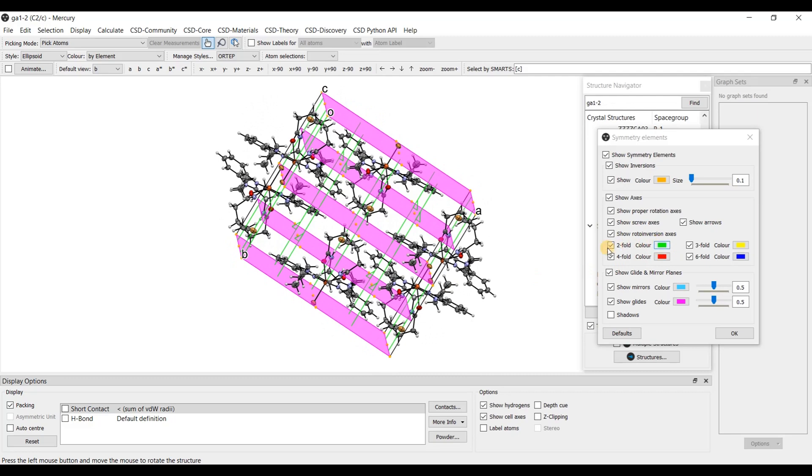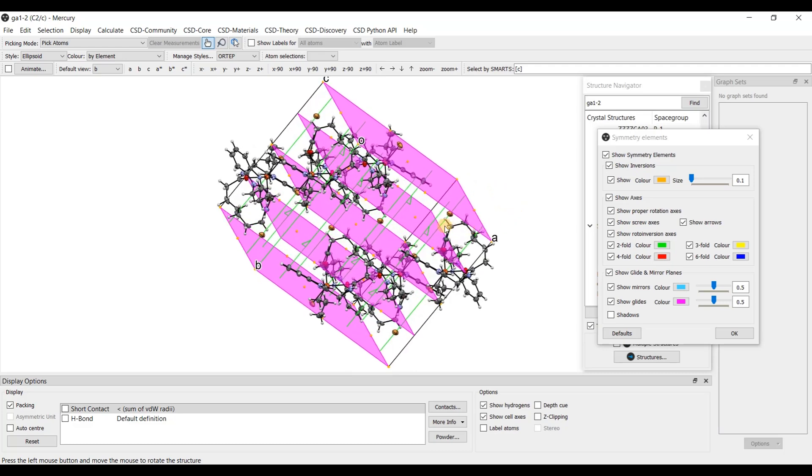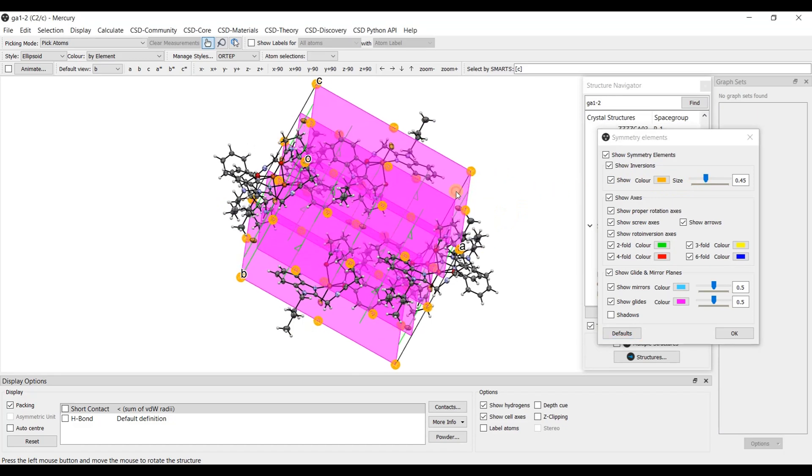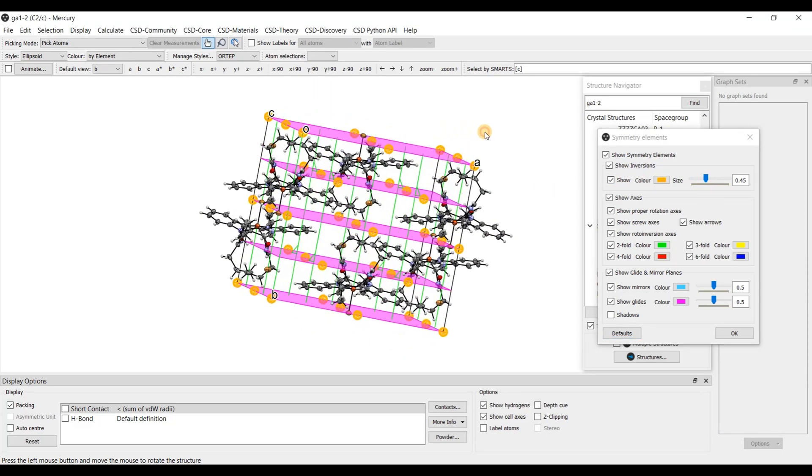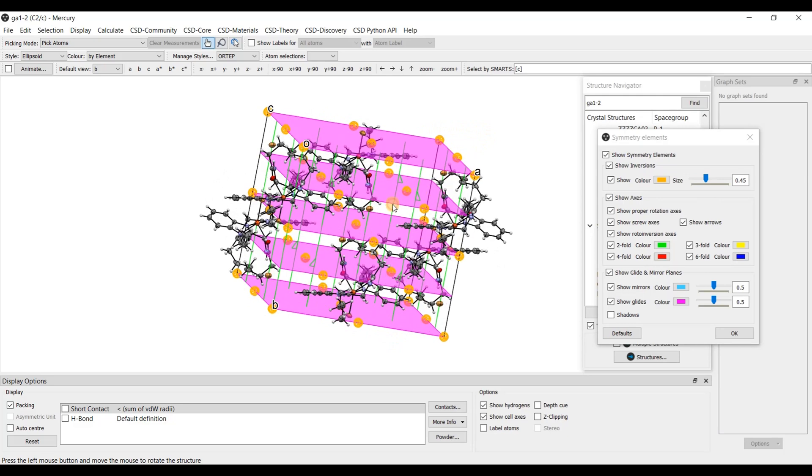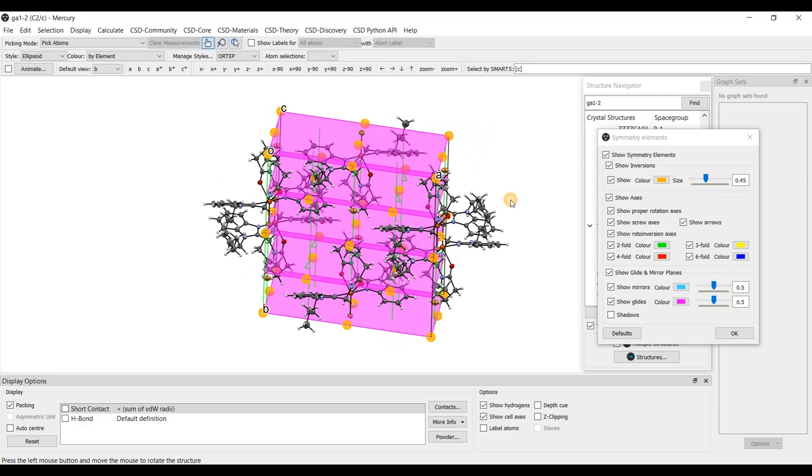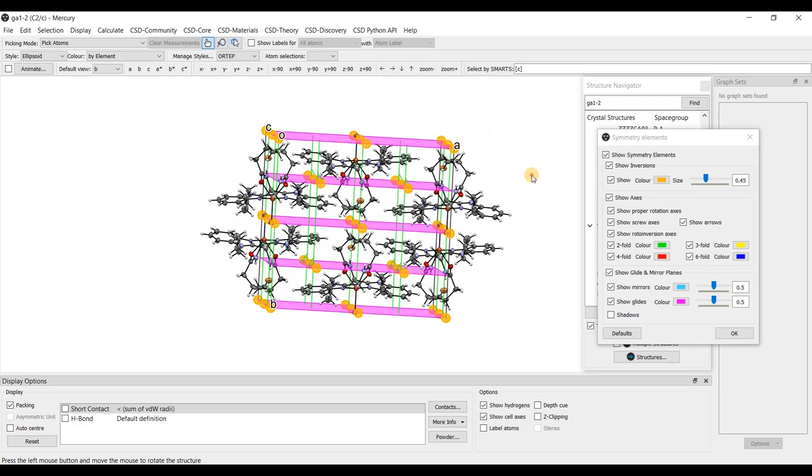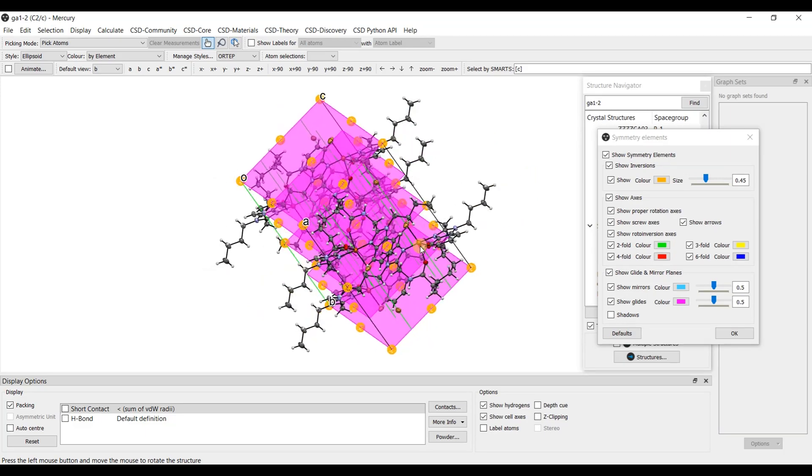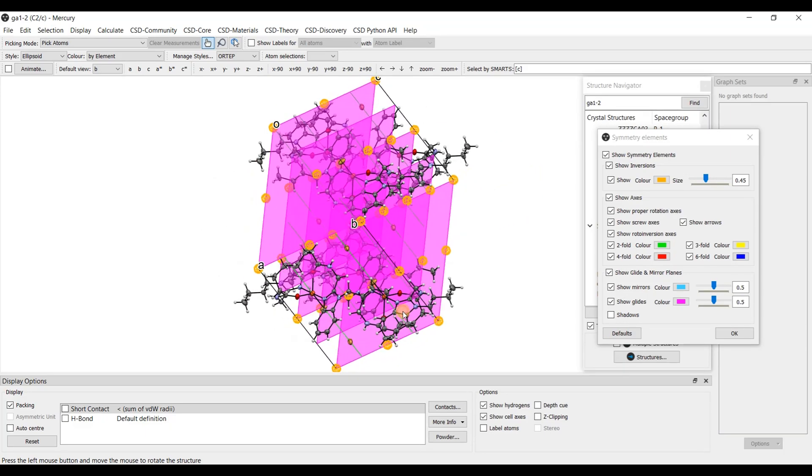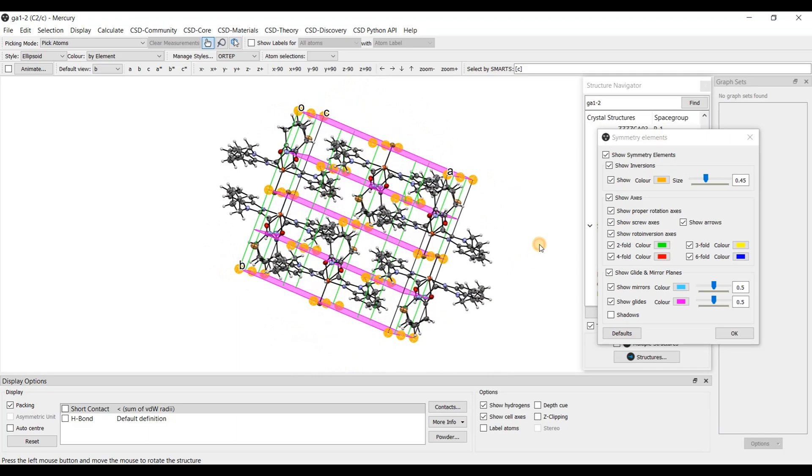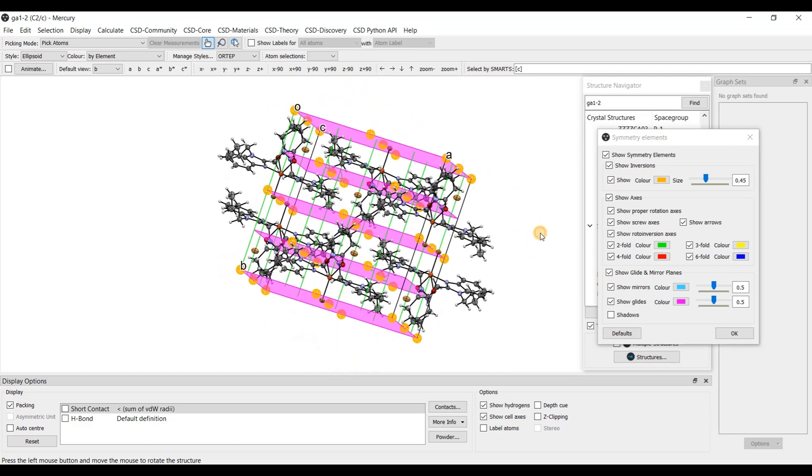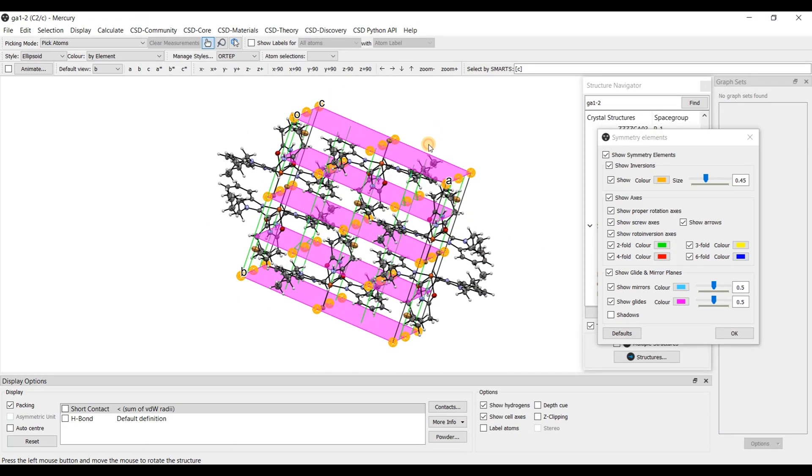Two-fold axis in green color and center of inversion in orange color. Let's increase the size a little bit for the inversion center. So now there is two-fold axis, there is glide plane c in some pink color. In orange color there is centrosymmetry and the axis, two-fold axis shown in the green color.